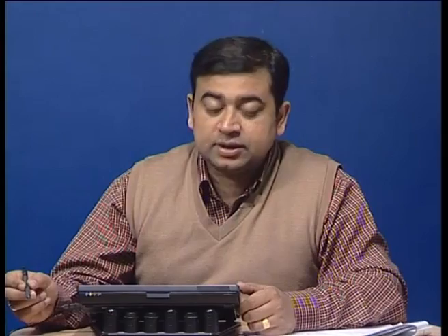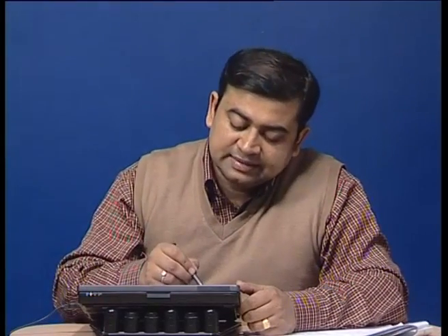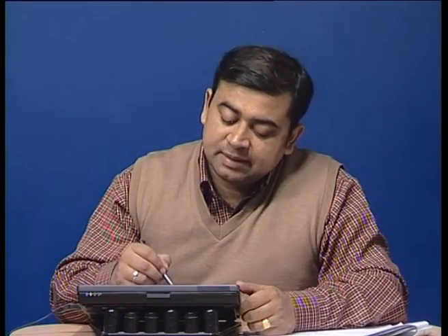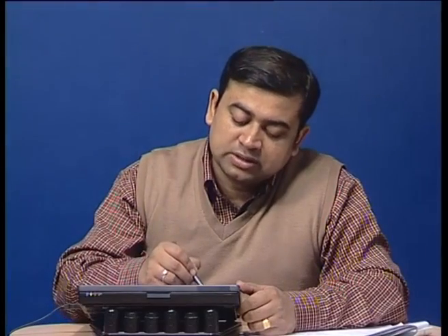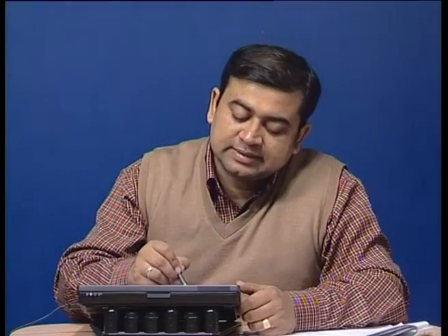So you have a lower energy signal, or intensity signal, of the particular emission frequency of the fluorophore, or the reporter dye in this case. You chemically immobilize the reporter at one end and the quencher at the other, with an understanding that as the hairpin loop is formed, the reporter and the quencher molecule are in close proximity, as you can see here in this particular example.